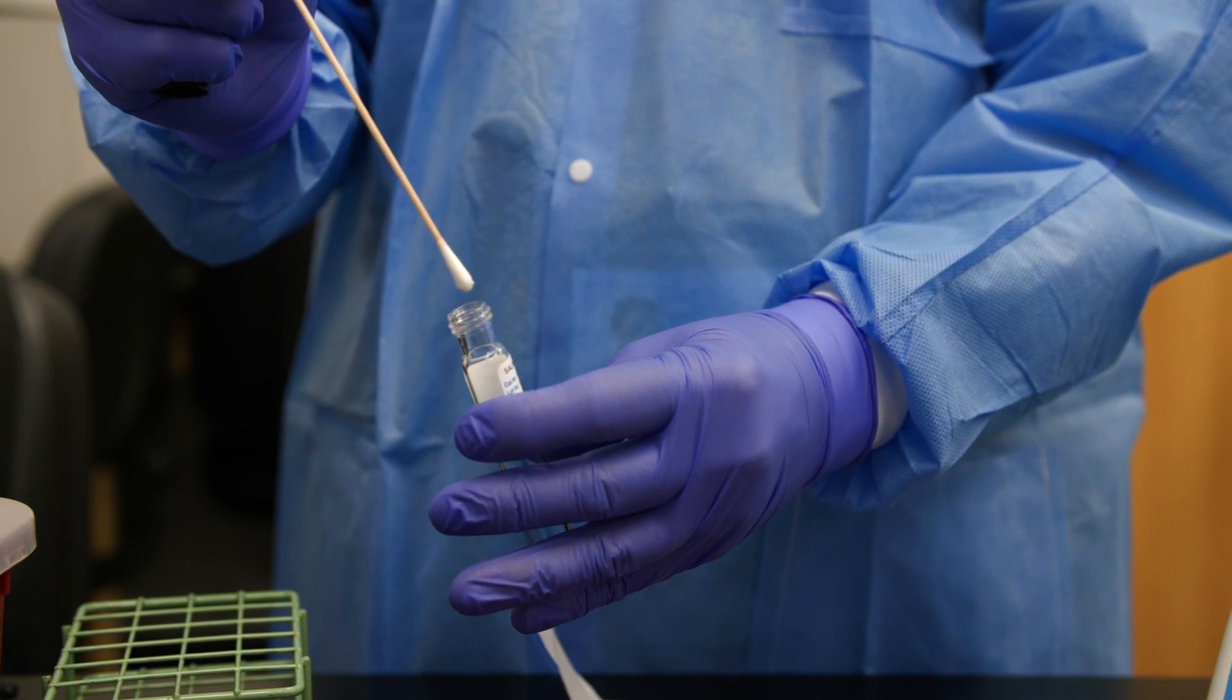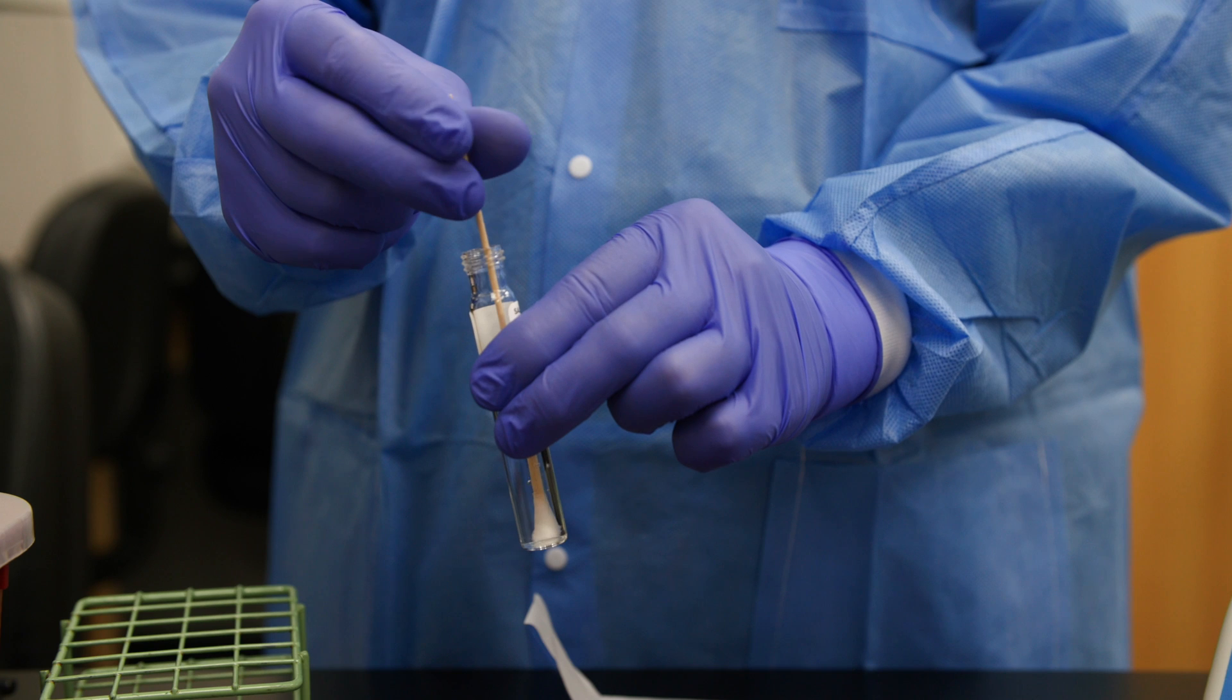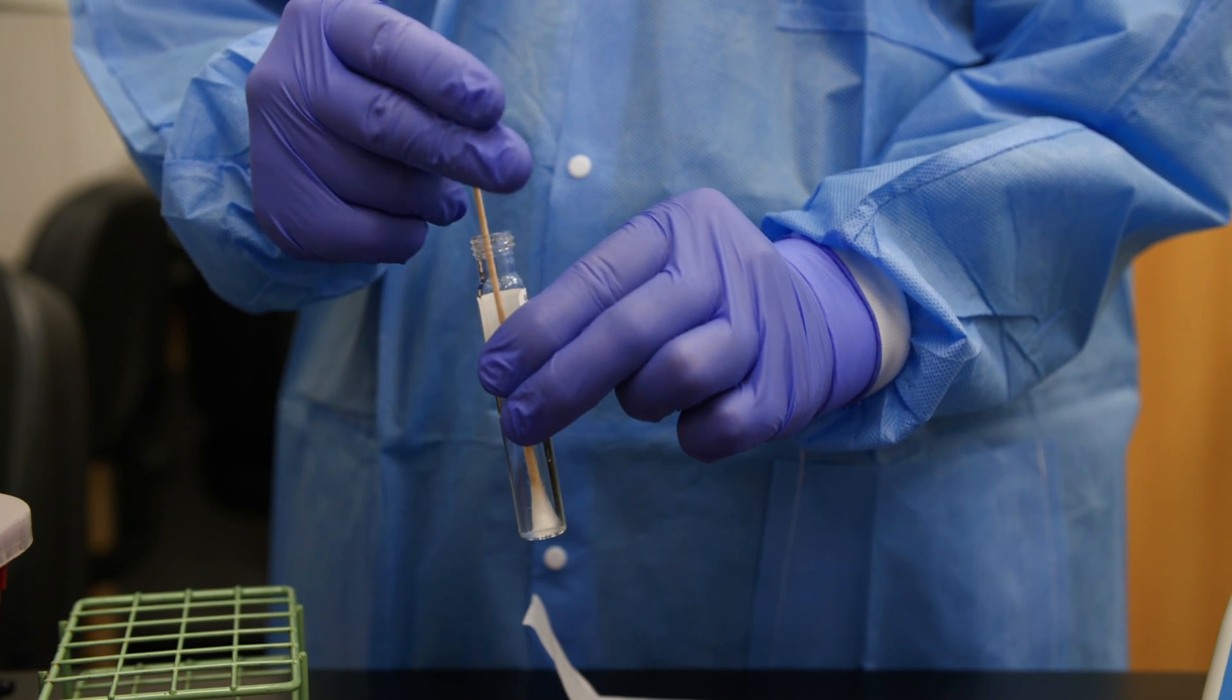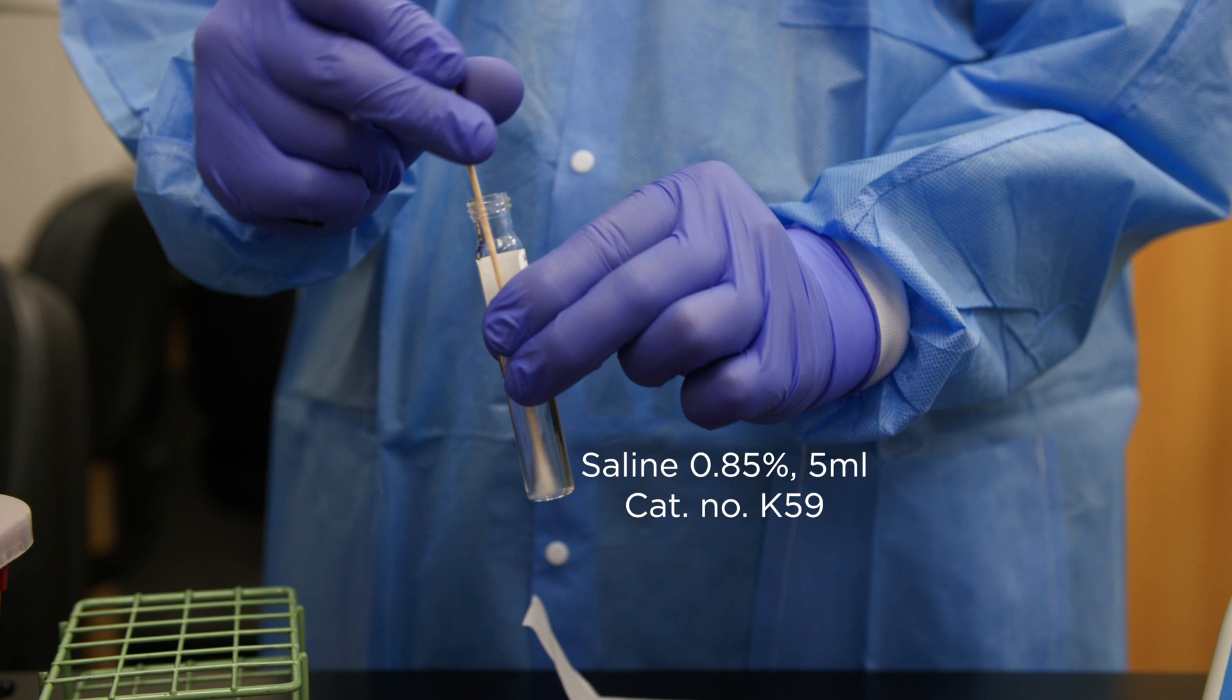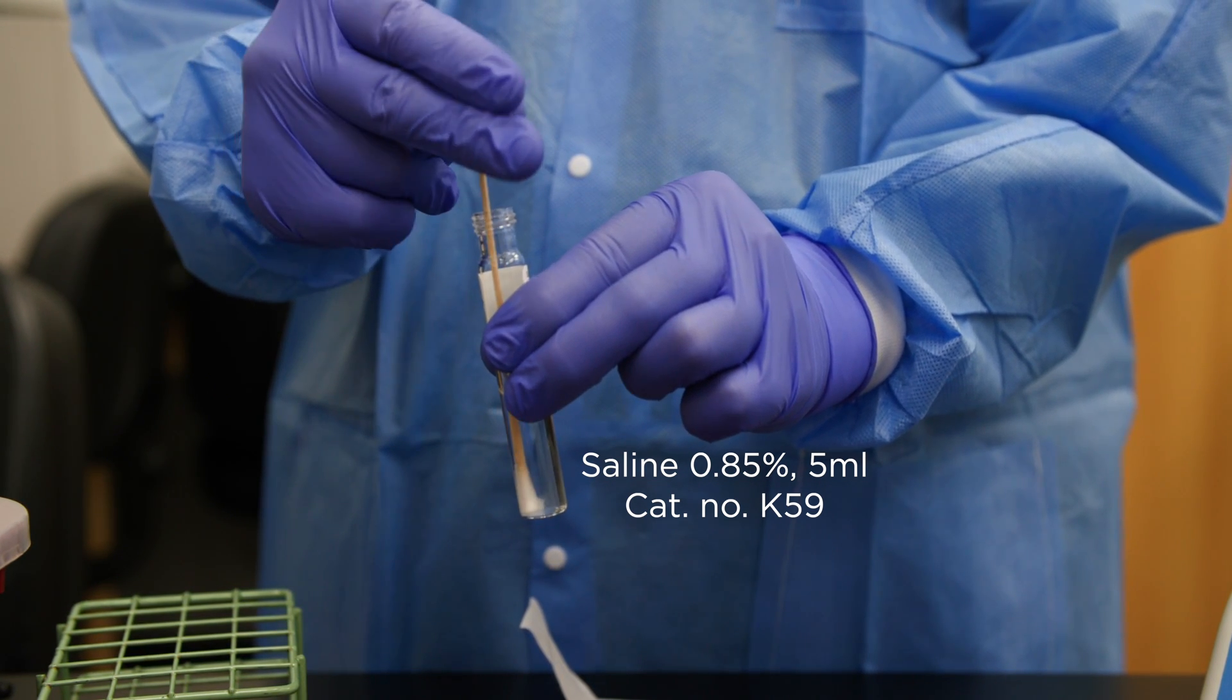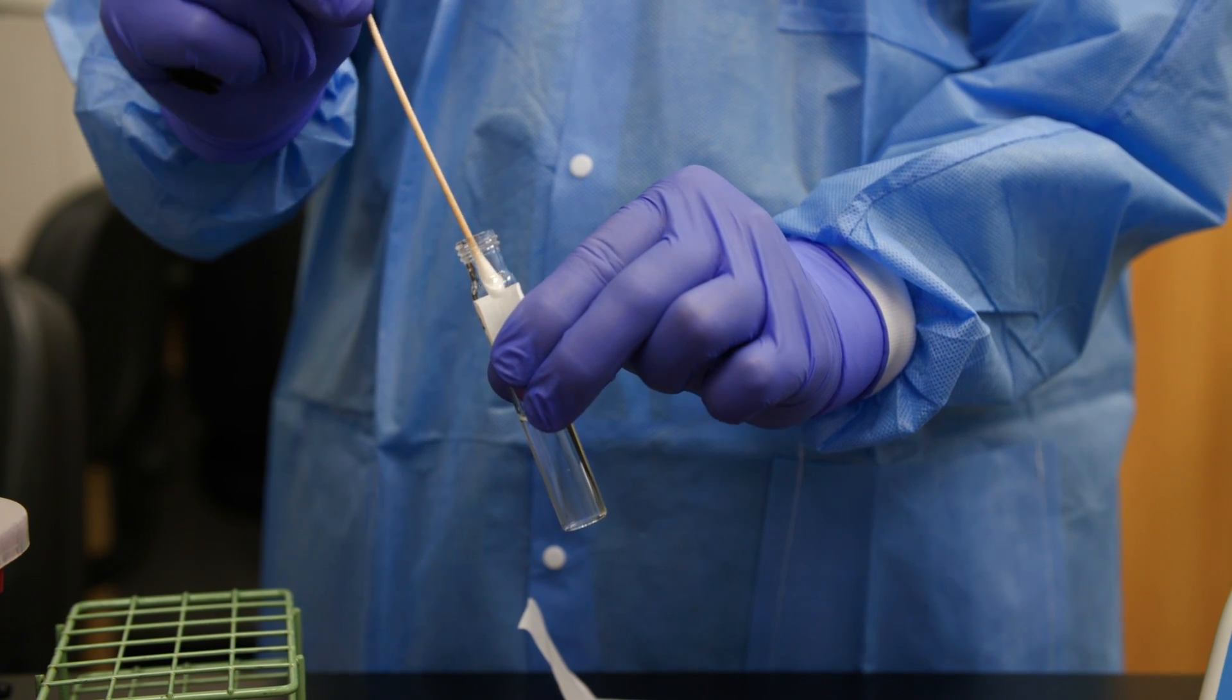Inoculate the bacteria from the swab into an appropriate diluent by rubbing the swab against the bottom and sides of the tube to create a turbid suspension. A 5 milliliter tube of saline is used in this example. Rotate the swab several times to ensure the bacteria is evenly inoculated into the diluent.